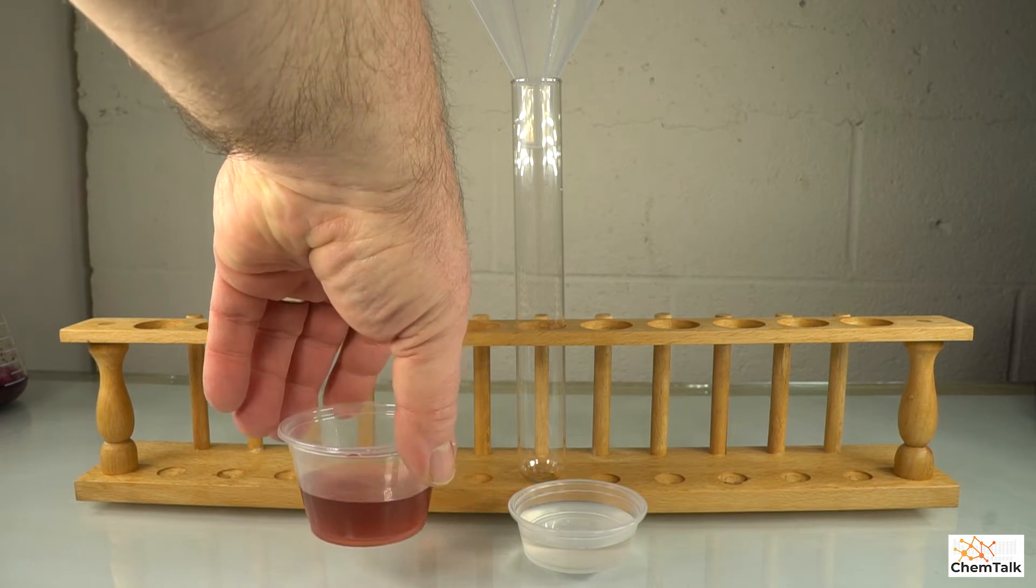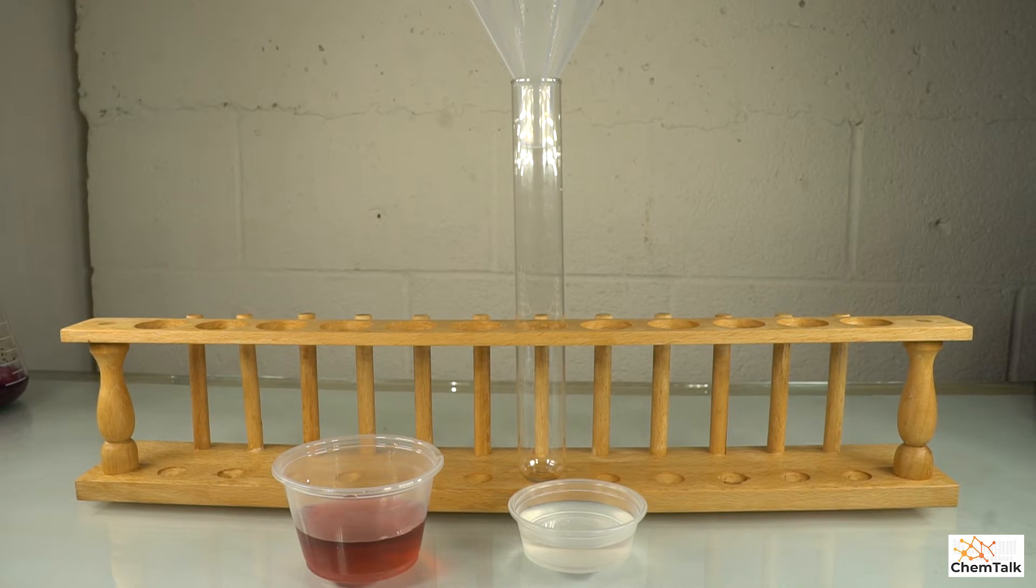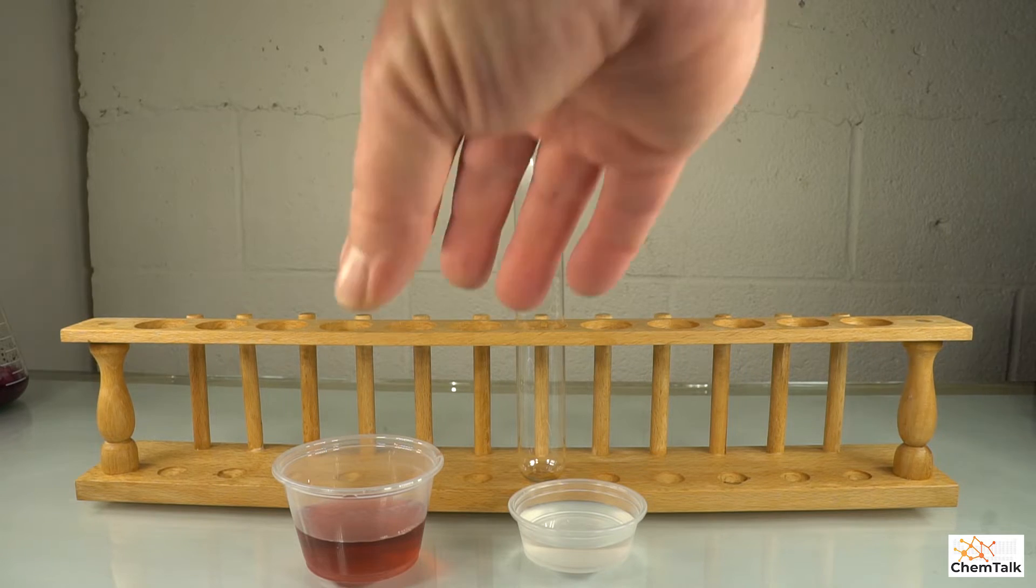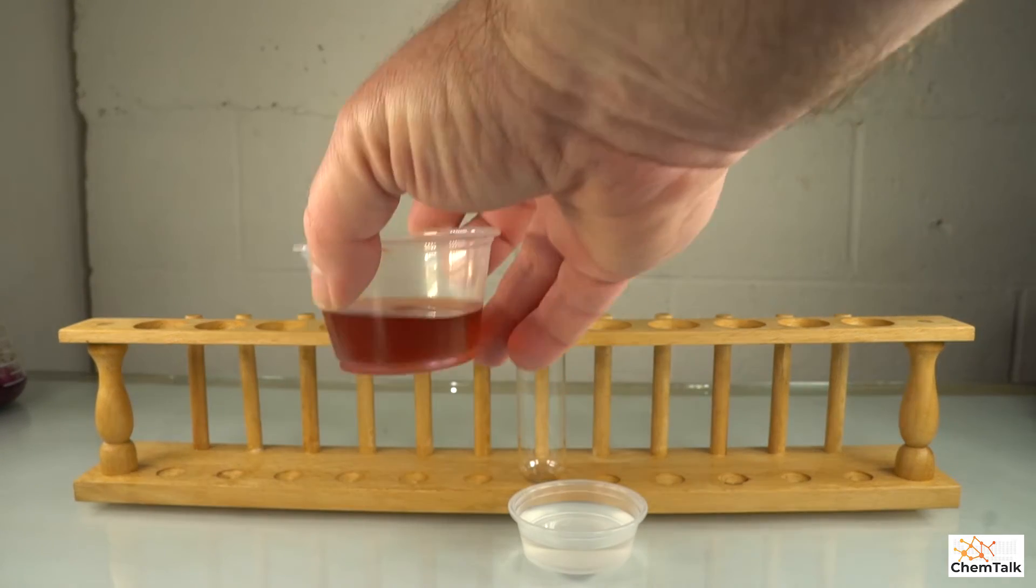And here we have 3.5 grams of cobalt sulfate with 40 milliliters of water. We're going to mix them and I'm going to show you what happens.